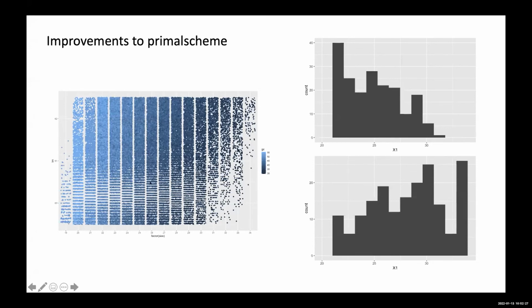So we just say that anything with these TMs is acceptable, of any length. So we've become sort of TM fundamentalists in that way. And we now basically allow anything from 18 to 34 bases to be included, which allows you to cover this big range of local contexts of GC within your genome. And you can see the change that's made between version 3 and version 4, and the most recent commit of PrimalScheme, where we used to have this bias towards the shorter primers. We now have no bias because we consider everything to be equal now. And I think that's going to improve things further.